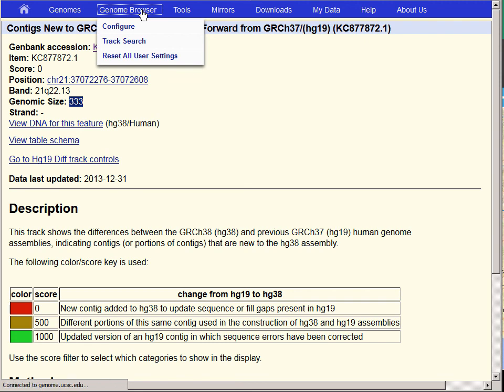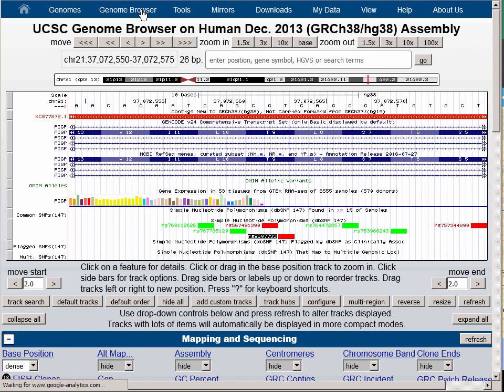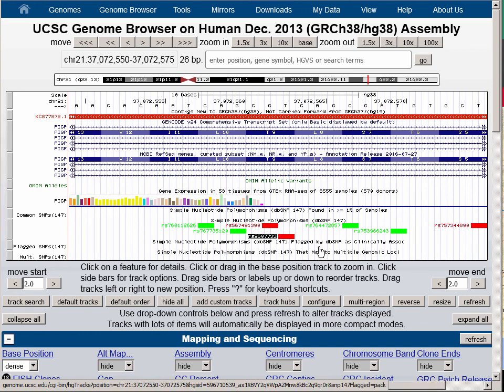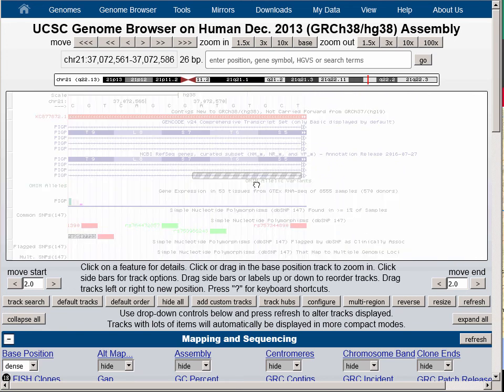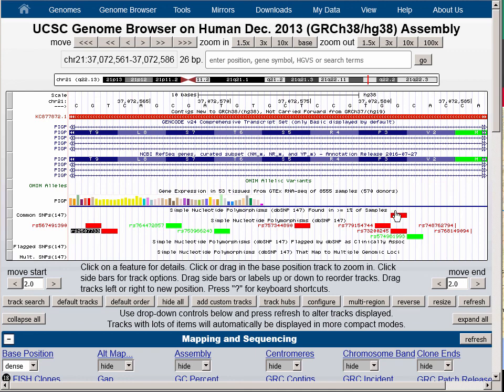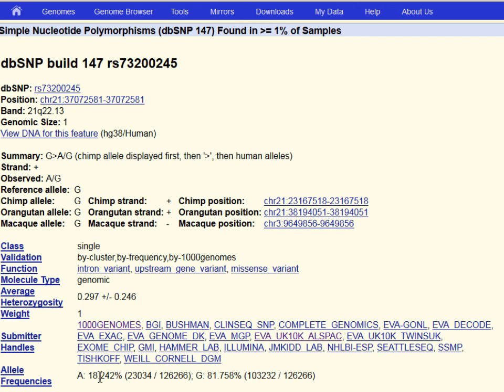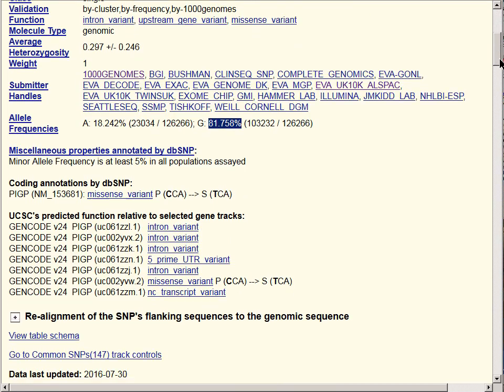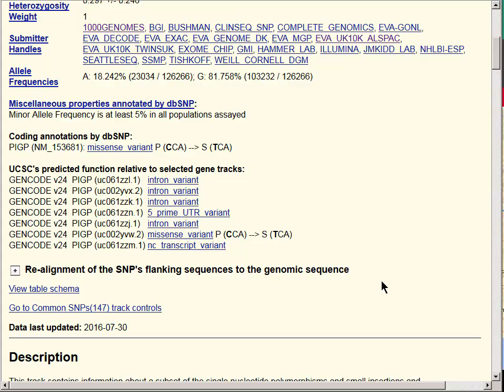Clicking back to the Genome Browser, you'll notice that this region has all four of the SNP tracks turned on, and that in this location only the All SNPs track has an annotation. It makes sense that in a coding region, common SNPs are not too abundant, because a SNP in a coding region is often deleterious and therefore eliminated from the population. There is one SNP in the region that represents a true polymorphism at 18% in the population and 81% reference. In only one of the isoforms is this variant annotated as an amino acid change — from a proline to a serine — and it is not a coding region in the other isoforms.